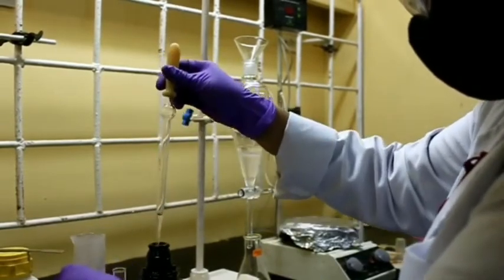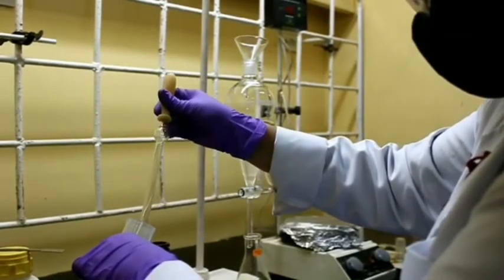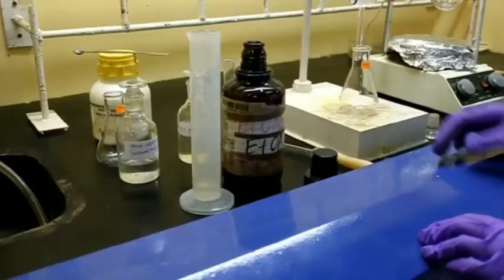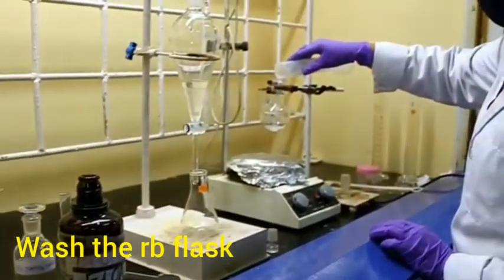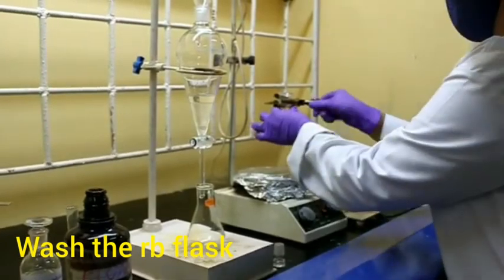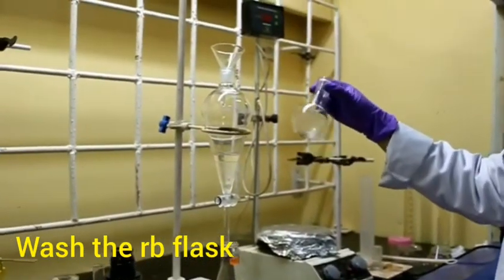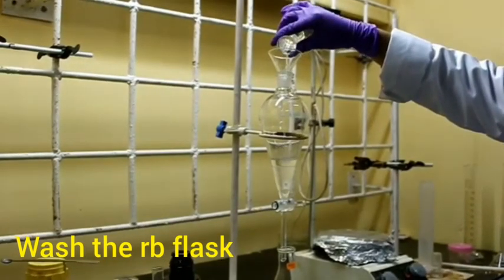Then we are taking a small amount of ethyl acetate in a measuring cylinder. We are washing the RB flask and transferring it to the separating funnel.